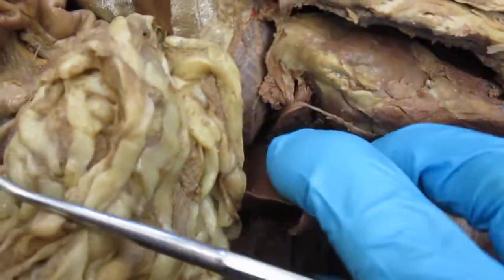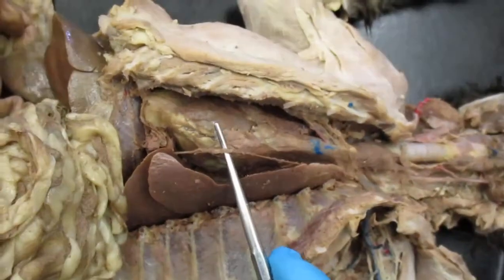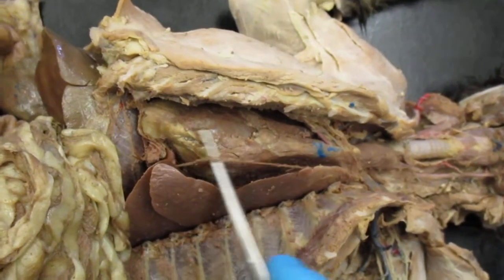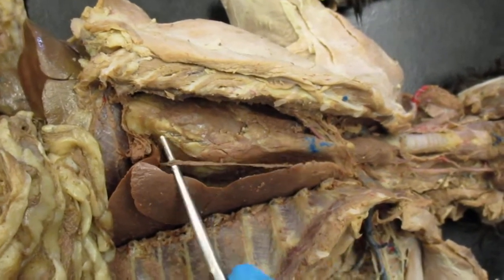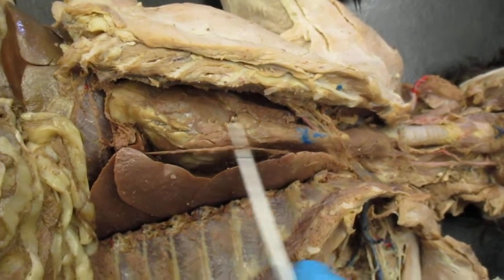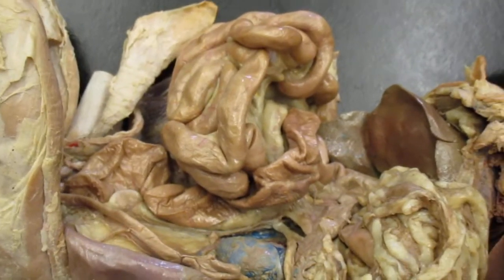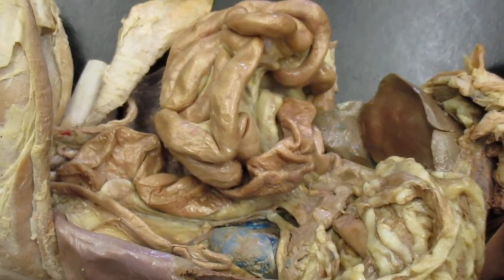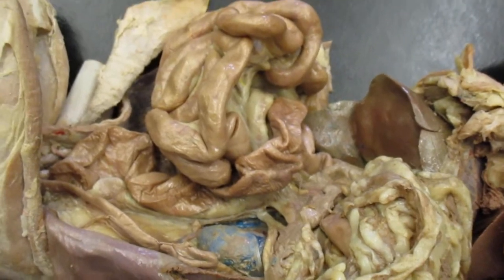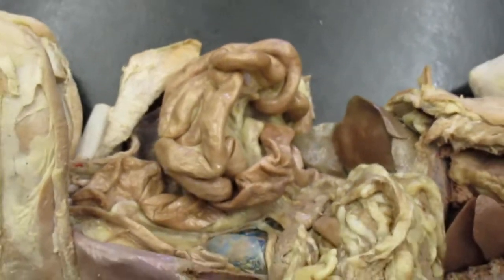Okay, let's do the vagus nerve. To look for the vagus nerve, you look in the thoracic cavity here. So here's your vagus nerve, and it's going to be one of the 12 cranial nerves in this parasympathetic division of your ANS. And it's going to pierce the diaphragm and go innervate the digestive organs like the intestines for parasympathetic division of your ANS, autonomic nervous system.